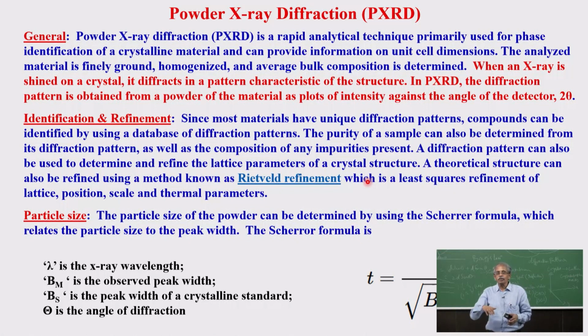Therefore you can easily find out the crystalline phase. You can also find your major phase and your small impurity in it. Impurities will give their own lattice, and the major compound gives its own diffraction pattern. Then you can see the overlay of these, and therefore you can find out, and if they are separated out, you can find the percentage of such things also. So you can use it for qualitative as well as quantitative work, and you can derive the lattice parameters and the crystal structure as a whole. If similar structures with similar lattices are known, you can use the refinement methods, such as the least squares method, for getting better positions, thermal parameters, and of course lattice constants.